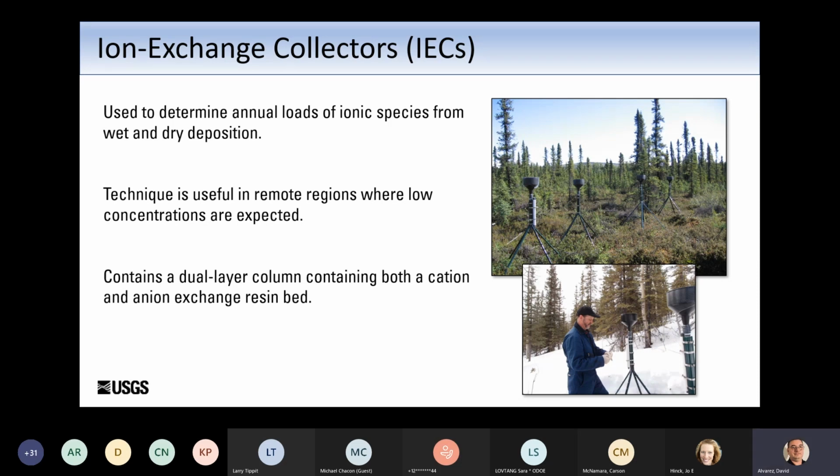There are many other types of passive samplers for measuring chemicals in the air, both for organics and inorganics. Much of this work has a foundation in the industrial and occupational health area, where passive monitors are commonly used to determine exposure to human workers. Are they being exposed to solvents or whatnot? Substantial work has been done to adapt those technologies into environmental air samplers.